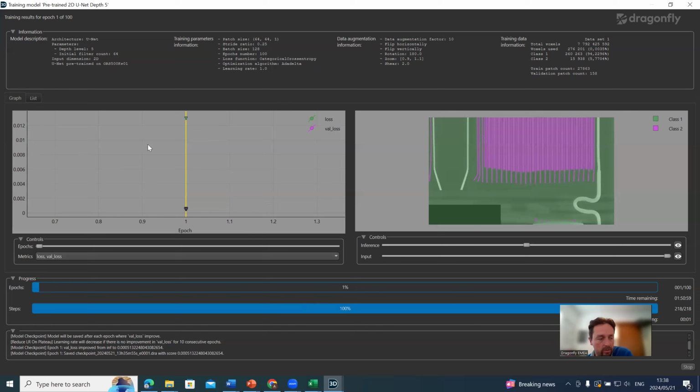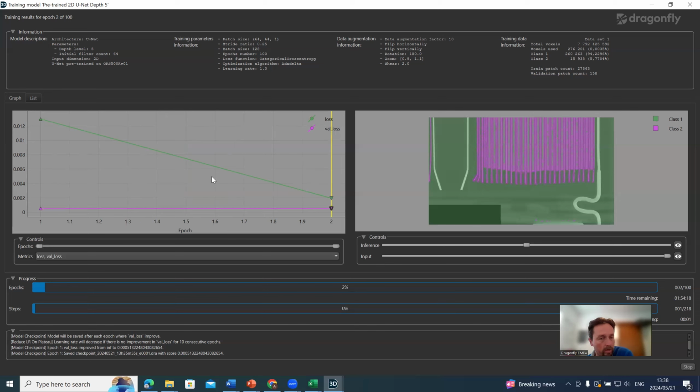So if these values decrease from one epoch to the next, as we see there, it did, then we're going in a good direction with the training. And typically you should leave this process for at least 20 epochs because sometimes there is a bit of settling down that happens. So as you see, it takes a bit of time.